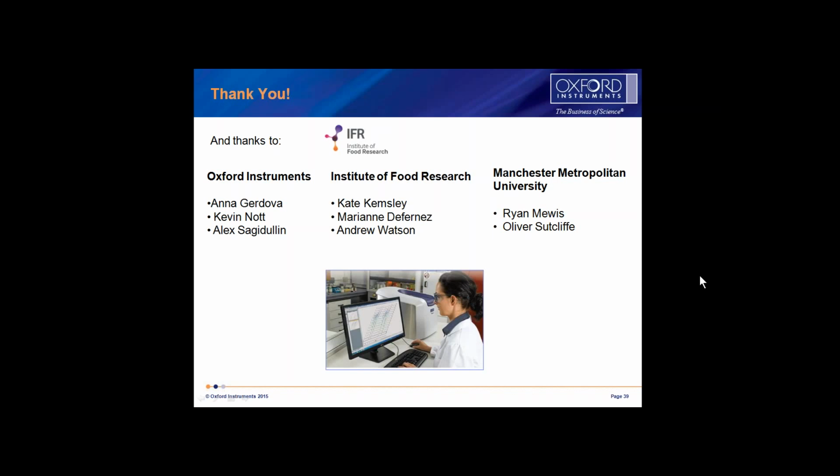Another question is, how is the instrument shimmed, and how often do you need to do this? We have a set of electrical shims, and we use an automated imaging method to do a full shimming. We can then iteratively shim the X, Y, and Z linear shims, and occasionally we do that once a day, but in general, once it's shimmed, if you had a sample in there, it would hold its shim for several days.